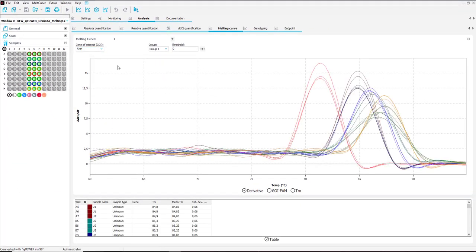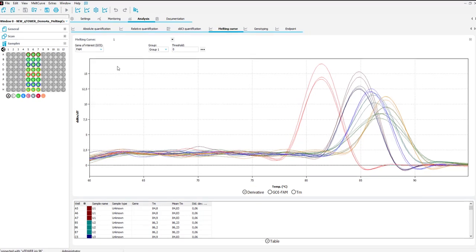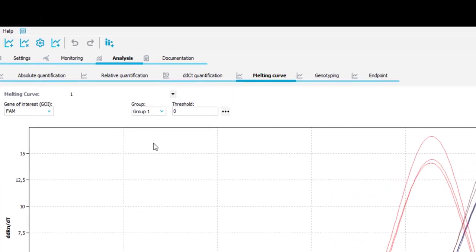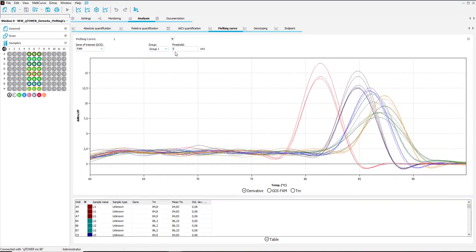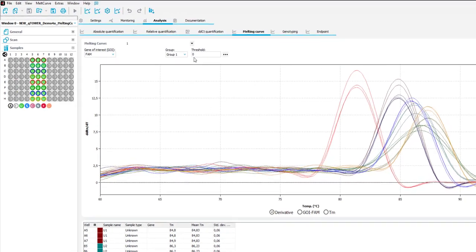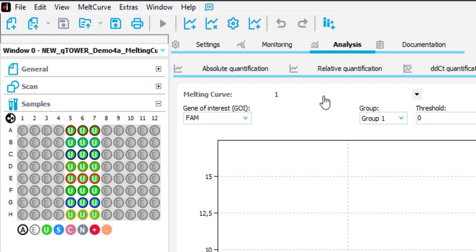The threshold will automatically be set by the software but can be adjusted manually by changing the value in the threshold box. For going back to the automatic threshold you can use the icon in the toolbar.